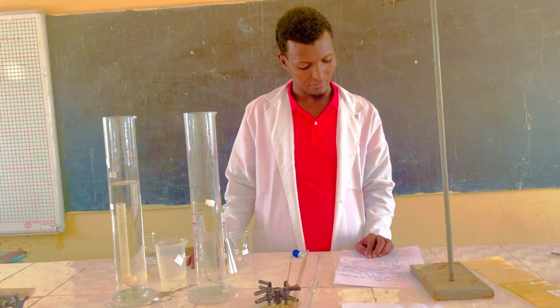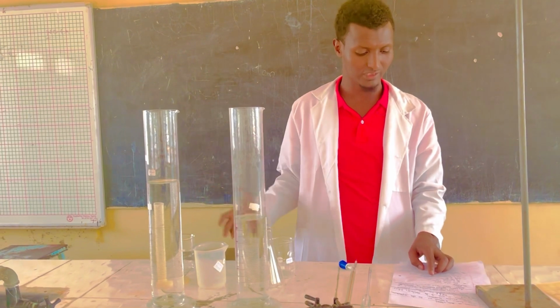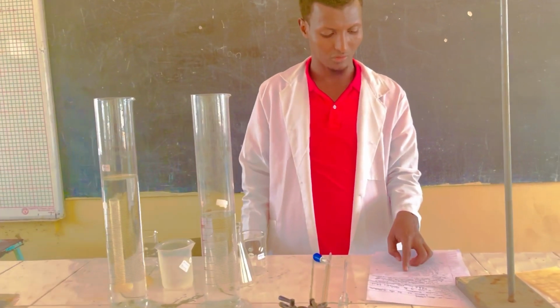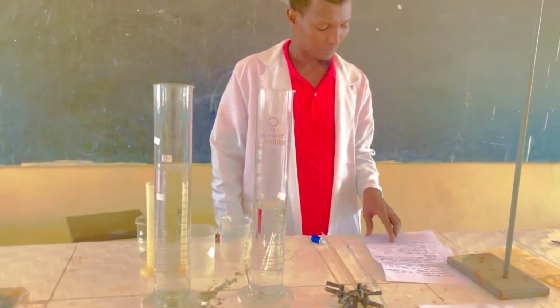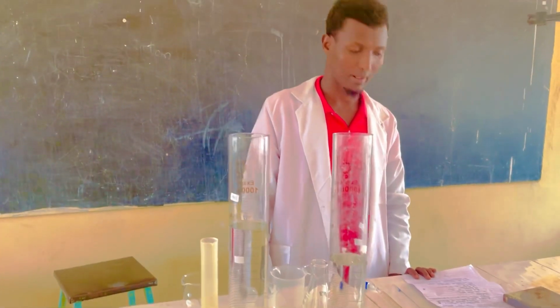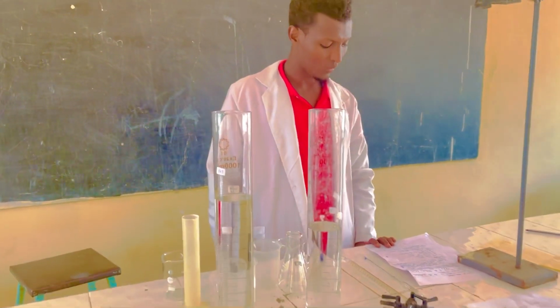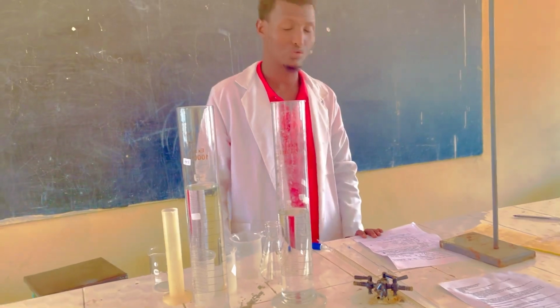We also have a conical flask, a burette of 50 ml, a pipette of 25 ml, 2 empty beakers, a label, measuring cylinders, and a stand to hold the burette. You are required to determine the mass of the sodium carbonate that was used in the experiment.